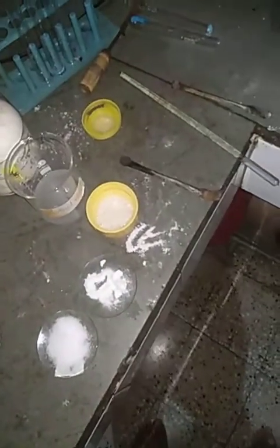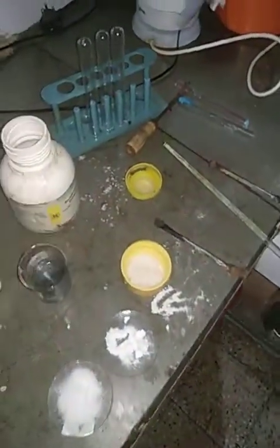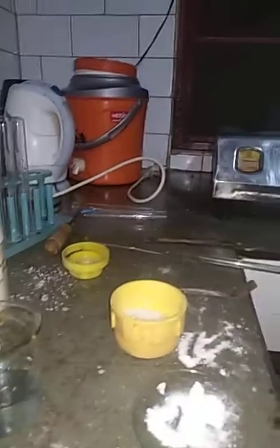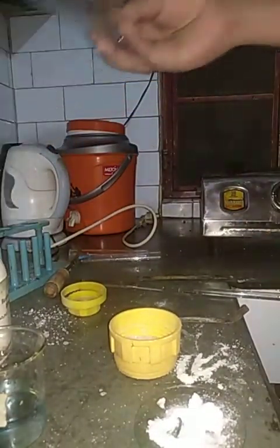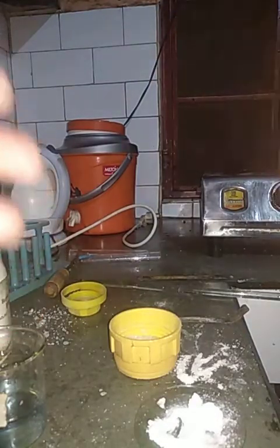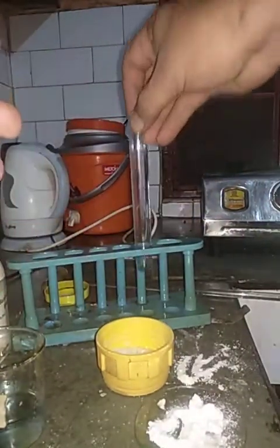Now we shall study their solubility in kerosene. So we have kerosene with us. You can see that I have kerosene, and this kerosene I am going to transfer into the test tubes. So here I have test tubes. These test tubes I am going to put here.